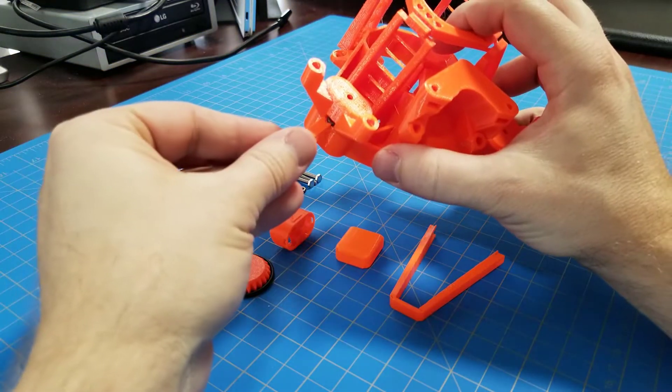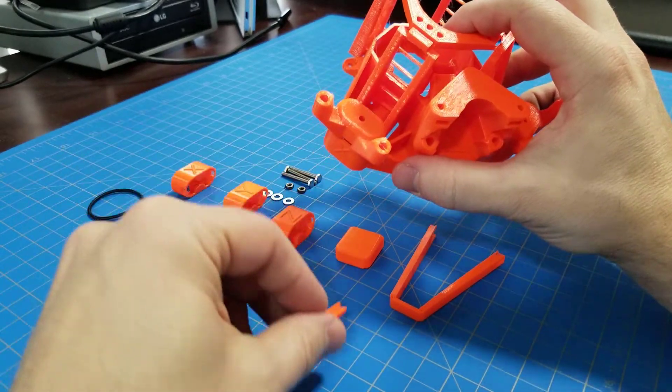I am showing how to assemble one of the actuators and then I'll speed things up. Try to keep up.